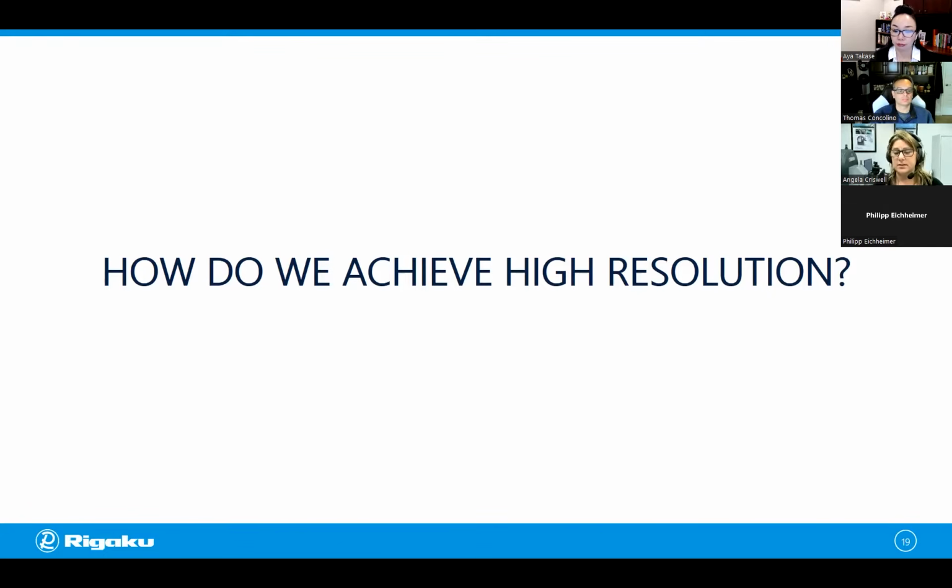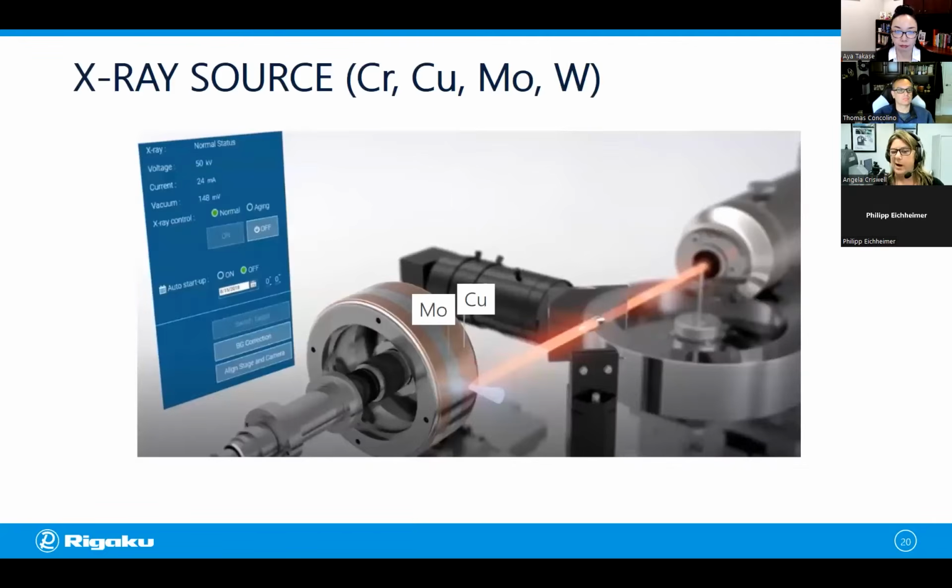And we're going to start with the instrument itself and ask, well, why did we choose that one? So I mentioned we're going to use the Nano 3DX system by Rigaku. And we chose this instrument because it uses parallel beam geometry. And that's well suited for high resolution CT data collection. And it has voxel sizes in the range of, say, 325 nanometers up to a couple of microns. And also we chose this because parallel beam geometry is less susceptible to blurring compared to cone beam geometry.